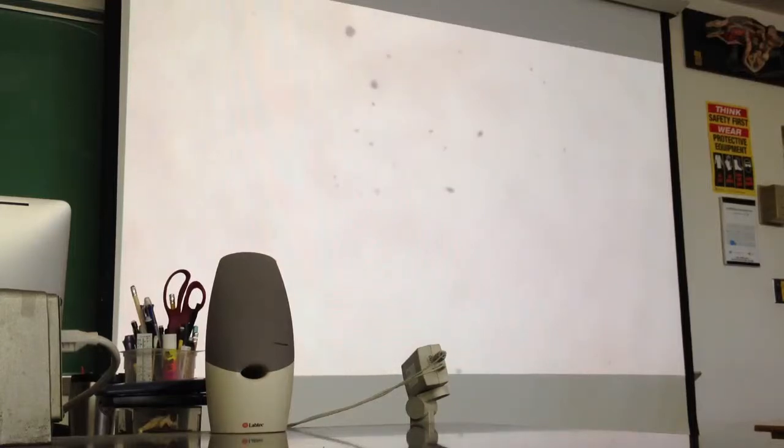The hardest thing to do with these two is to decipher which one's the urinary bladder and which one is the ureter. The ureter samples that we have are really tiny, so it's actually kind of hard to find them sometimes.